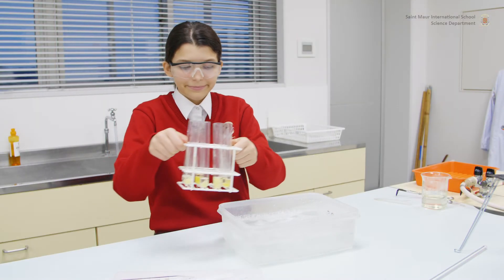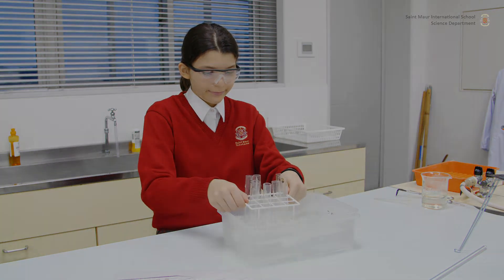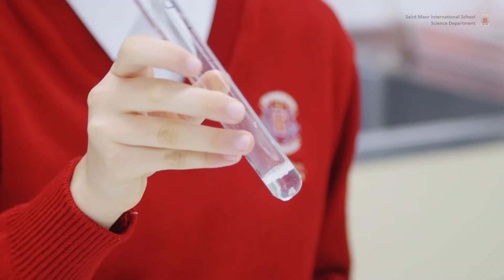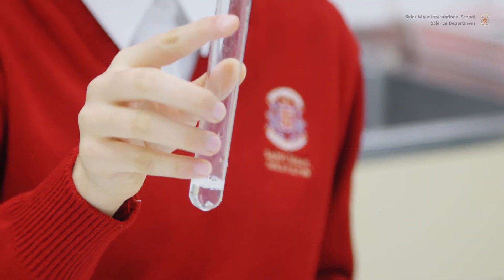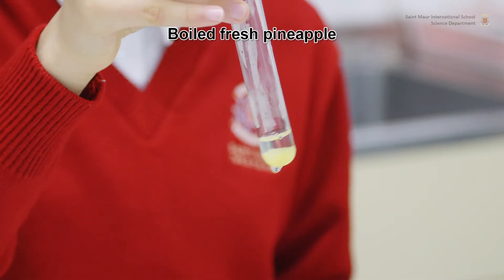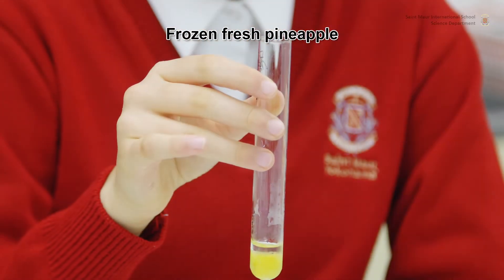Place all test tubes into a melting ice bath. When test tube one containing gelatin only has gelled firmly, you can remove all the tubes. Tilt each tube to check for gelatin consistency and record your observations in a table.